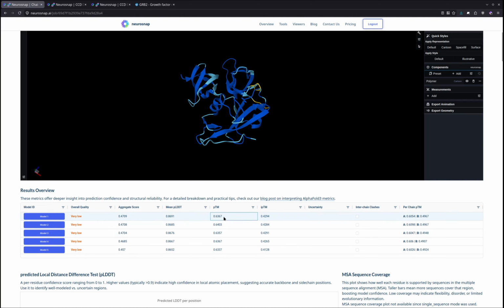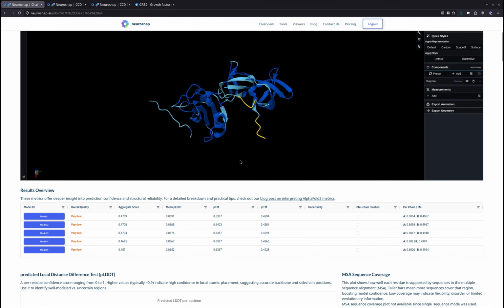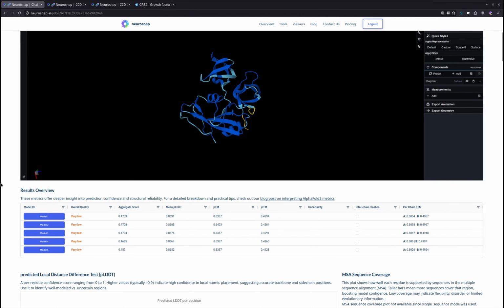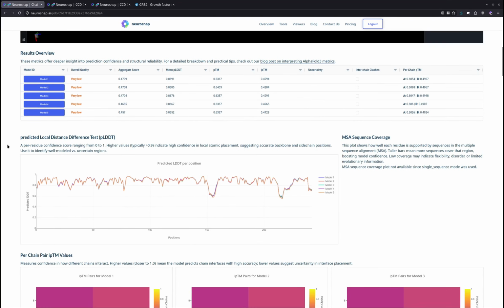Now, as we can see overall, the pLDDT is strong for this particular set of predictions, but the pTM score is fine, like 0.6 is definitely within a tolerable range. However, the ipTM score is not very high, so it's more likely, or at the very least, Chai-1 personally doesn't think that this is a very likely interaction, which is unfortunate, but that's just how you'd interpret these scores. Generally for ipTM, you want them to be at least 0.7 or somewhere within that range. We have a couple of presentations on this as well.